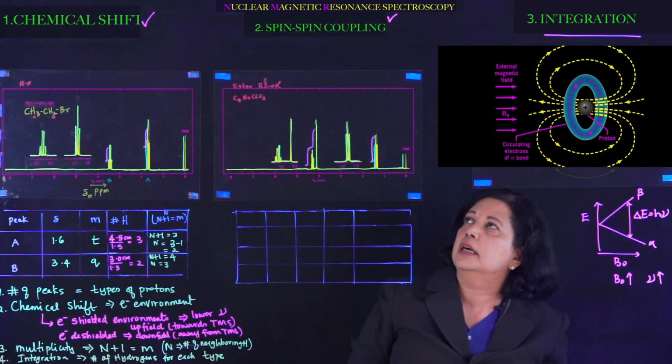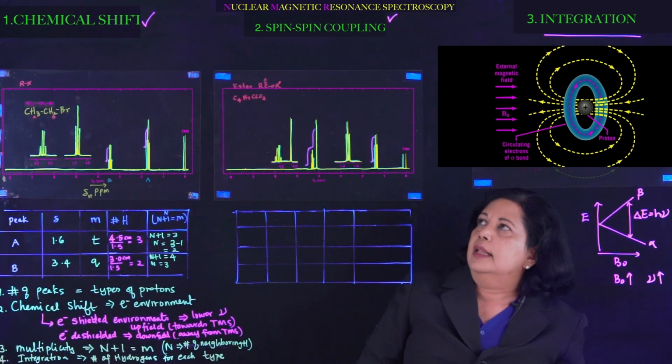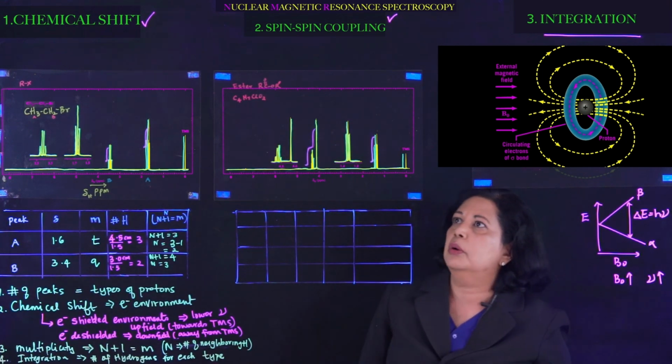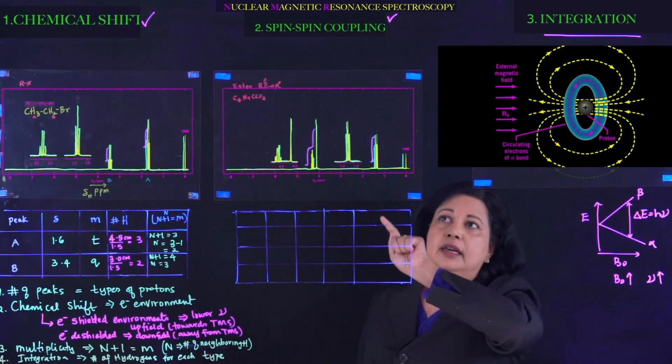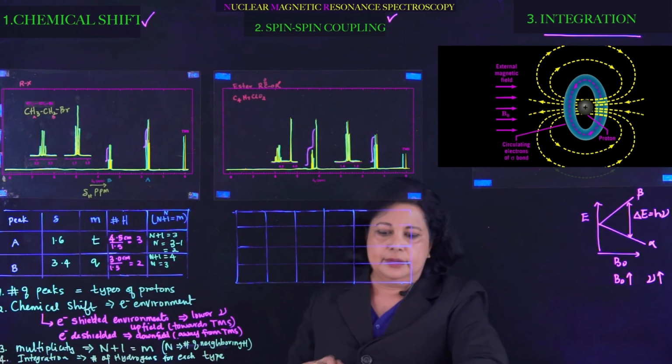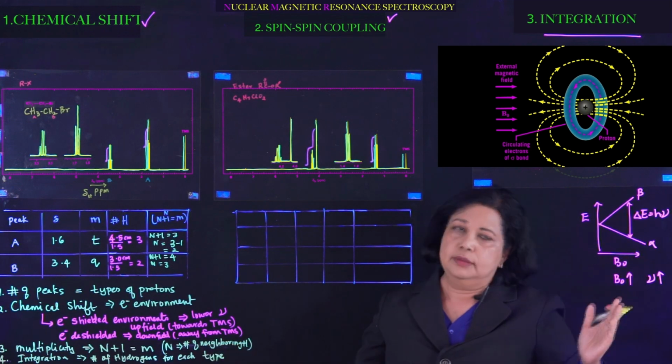So we'll have 3 carbons that would go into the side chains of the alkyl groups. There's also chlorine over here. Let's look at it, shall we? Let's do the same thing we did. So always have a plan for each one. And well, this is my plan.